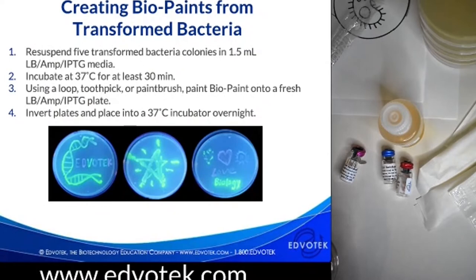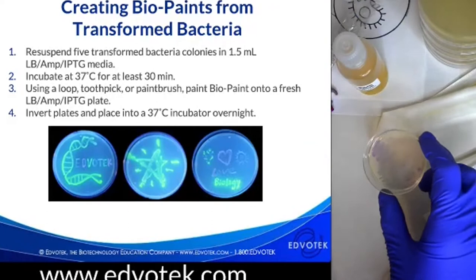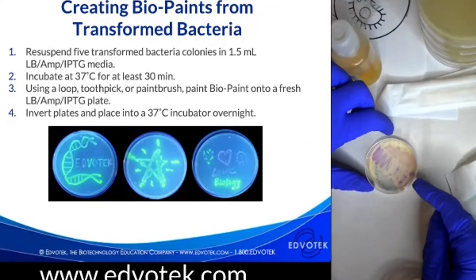And so if we are creating the bacteria from pre-transformed colonies, I do have one plate here, which is just our transformation plate. Let me get to it. Oh, I'm giving away many of my results. Oh, good, I kept them off screen. Okay, so here is a plate with some of our chromogenic bacteria. And you can see here that we have pink, we have purple, and we have blue on this plate.